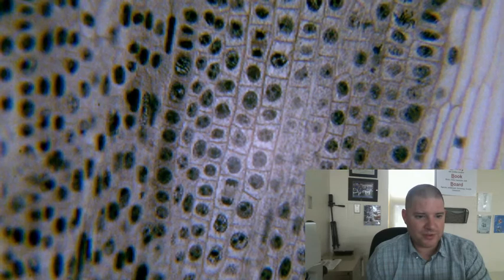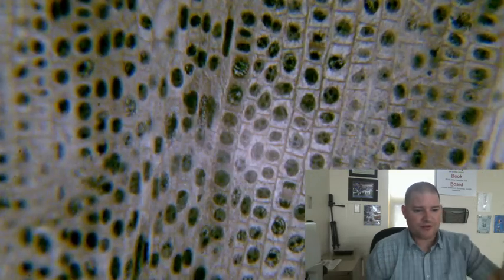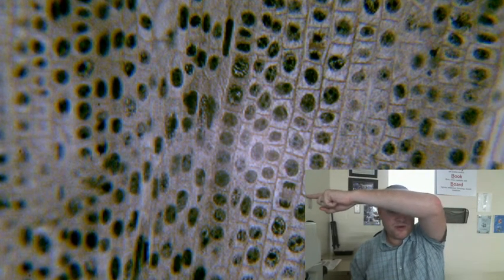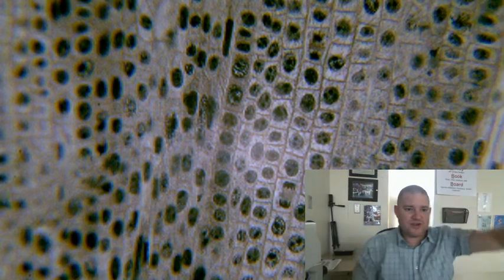Oh, there's a couple of good telophases right there. So right next to me in the picture right here, like almost right where I'm pointing, that's a good telophase. Right above me and kind of up towards the top is another good telophase.